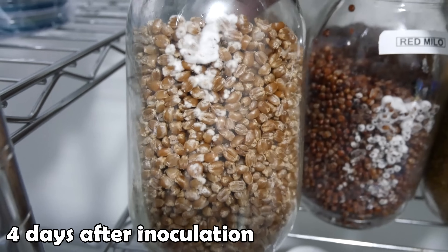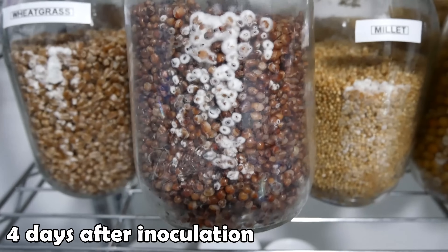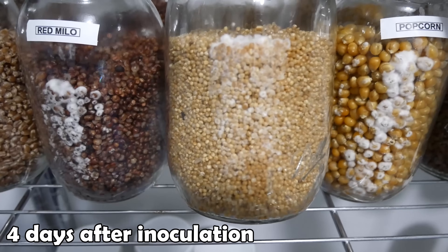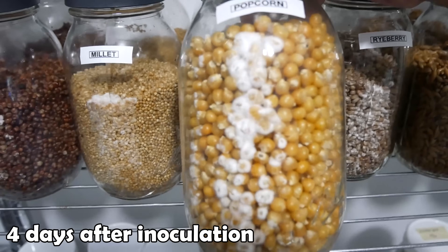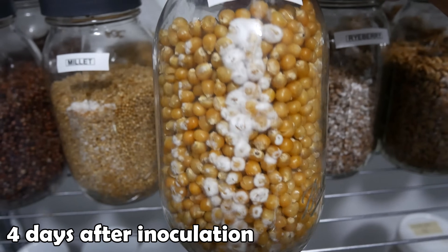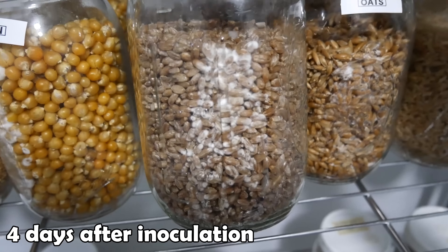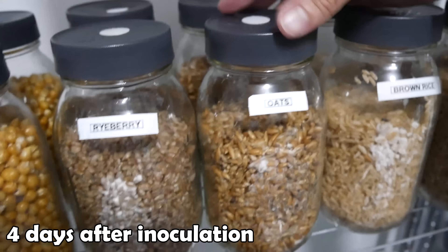Here we are four days after inoculation. We're starting to get good clean growth across all the jars. We have wheatgrass, here's the red milo, here's our millet — millet seems a little bit light, almost very similar to the red milo in terms of colonization. Here's our popcorn — popcorn is doing exceptionally well, lots and lots of growth already compared to the other jars. Here's our rye berry, our gold standard grain, seems to be doing pretty well. The growth rate seems very similar to the wheatgrass — they're kind of similar in size.